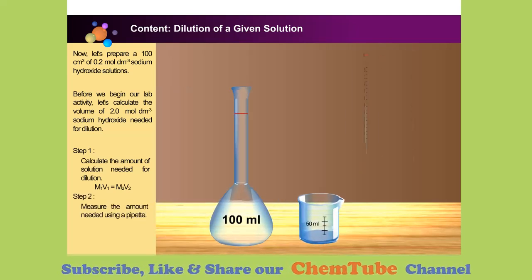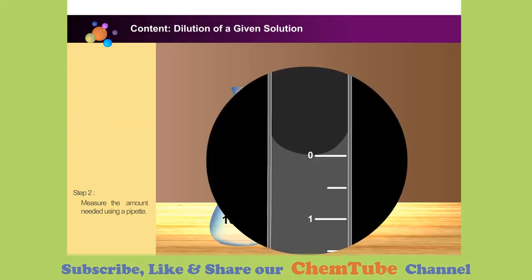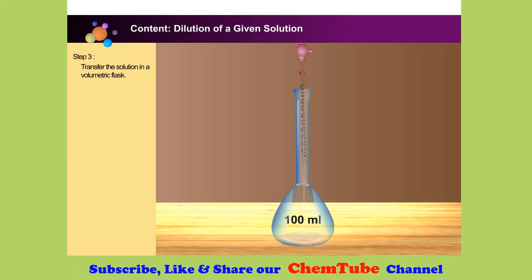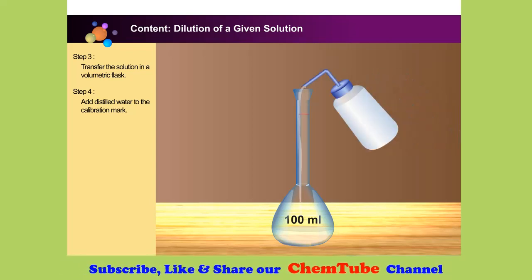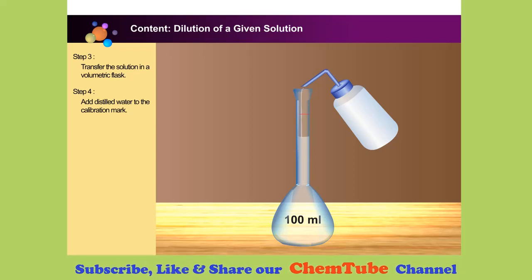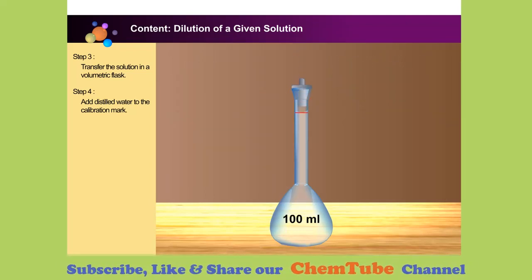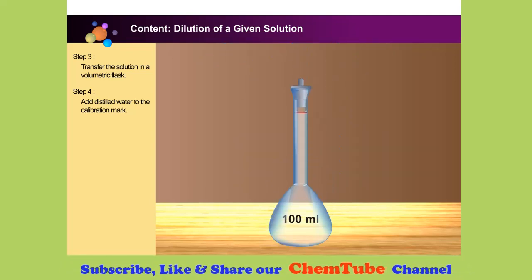Use a 10 millilitre pipette to draw up 10 cubic centimetres of sodium hydroxide solution and transfer it to a 100 millilitre volumetric flask. Add distilled water into the volumetric flask until the meniscus level reaches the 100 cubic centimetre calibration mark. Close the volumetric flask tightly with its stopper and invert the flask several times to ensure thorough mixing. Our solution is now ready.